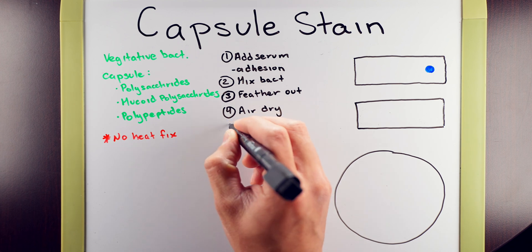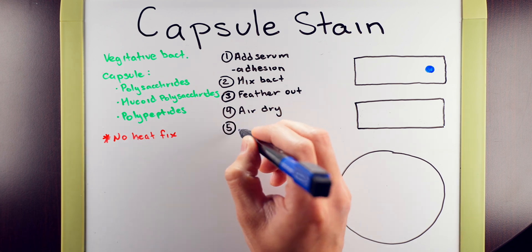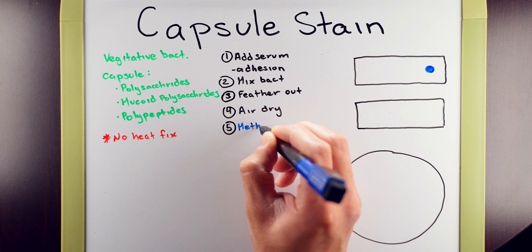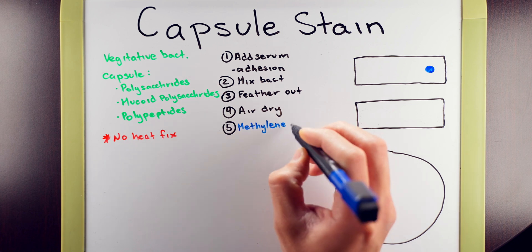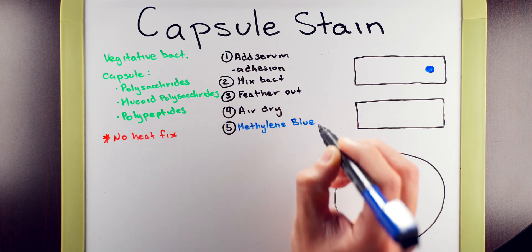Once your slide has air dried, you can add your dye. In this example, we're going to use methylene blue. For your lab, it might be different, so make sure to note what stain you're using and how long you're staining it for.